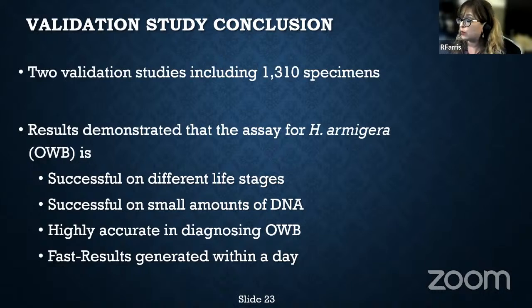When I say within a day, it's because we still have to include the extraction step and then the real-time PCR step. So once you include all of the work that's involved, we can have results within a day, as opposed to 2 or 3 days if you're using other methods.